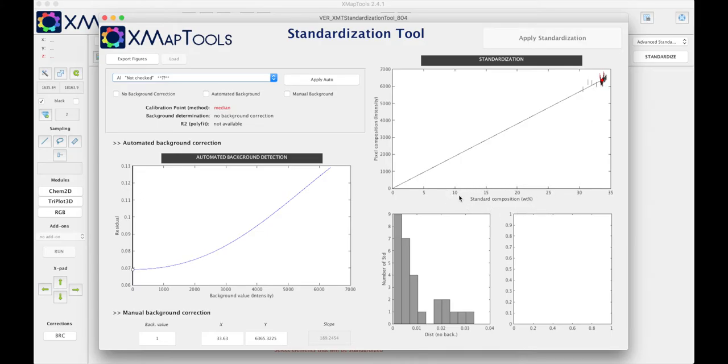This diagram shows the standard composition of the spot analysis against the pixel composition in x-ray intensity of the corresponding pixels for the element selected in this menu.